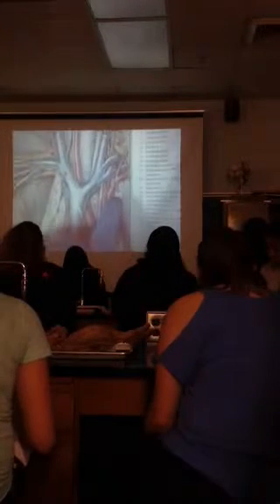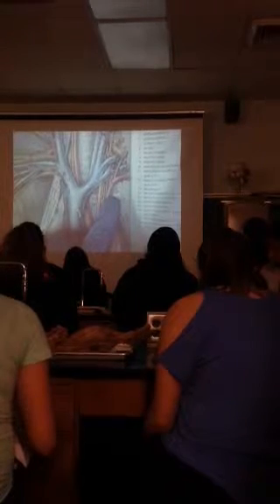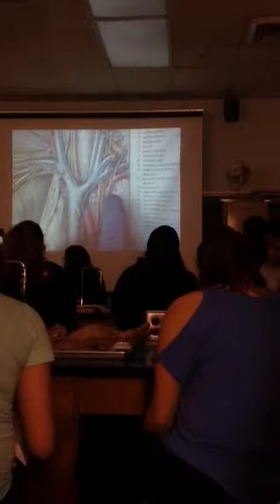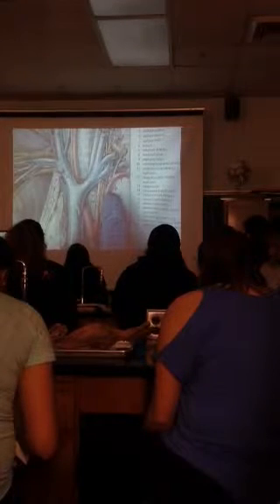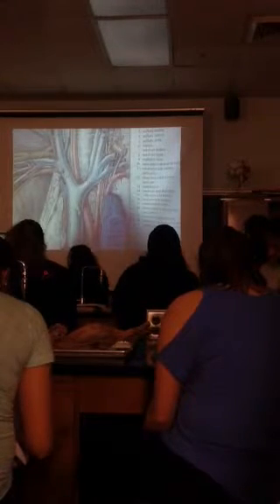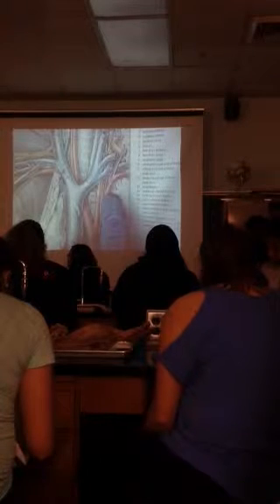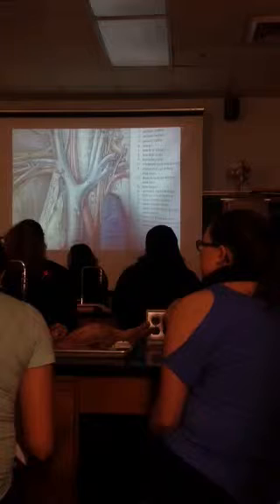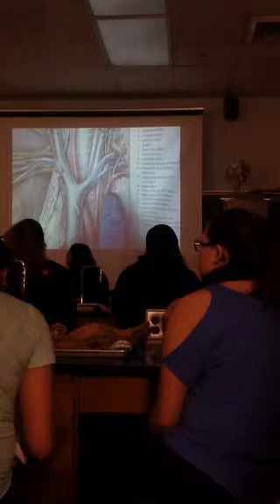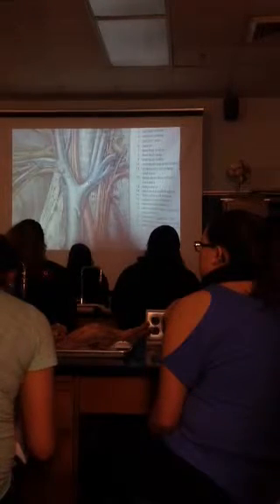Off of left subclavian, we have the VCT. The way I remember this, the arteries, vertebral, costocervical, thyrocervical. It's reversed in the human. It goes VTC. So humans go to Virginia Tech. Cats is VCT, C for cat first. That's kind of how I remember it.